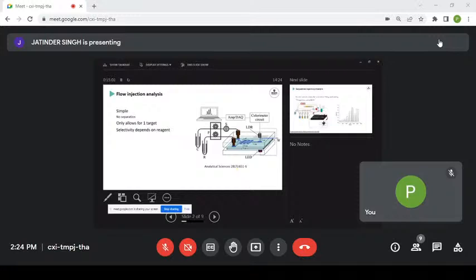As we spoke through yesterday, mixing in microfluidic systems is really hard because we have low Reynolds number and laminar flow. Think about the windows here. Really nice lecture room to have laminars through. So our flow looks like that. Mixing is really difficult, and that means we need some time to do the mixing. At a certain flow rate, we can increase the time before our detector by increasing the length of the channel. So here we end up with a 25 millimeter channel in a 5 centimeter chip.